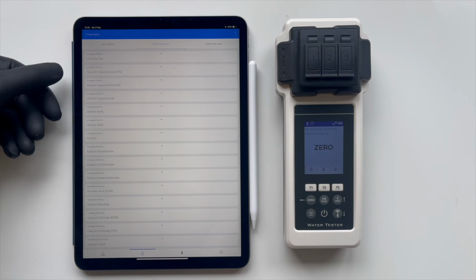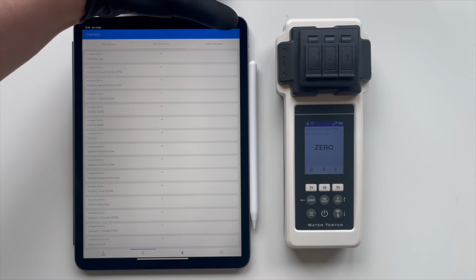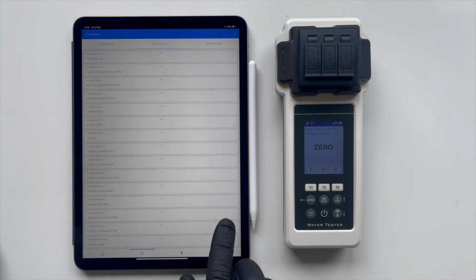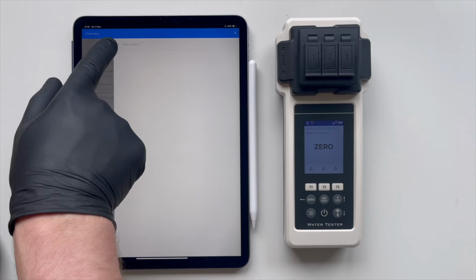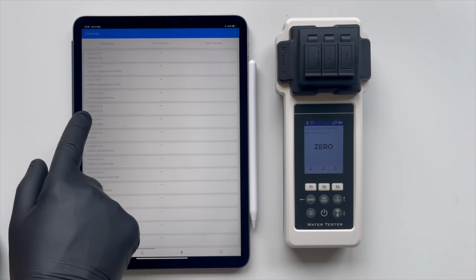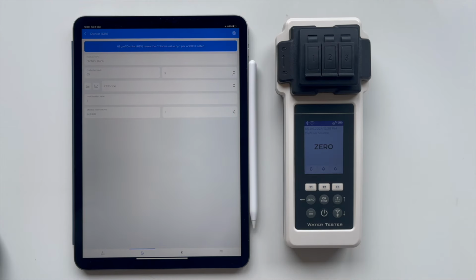To add a chemical you use, click on the 3 dots located in the upper right corner of the app's interface. This will bring up the menu where New Product is the available option for adding chemicals to the app's database. We'll demonstrate with Dichlor, a commonly used chemical in pool maintenance. Dichlor is known for its effectiveness in sanitizing and maintaining chlorine levels in pool water.